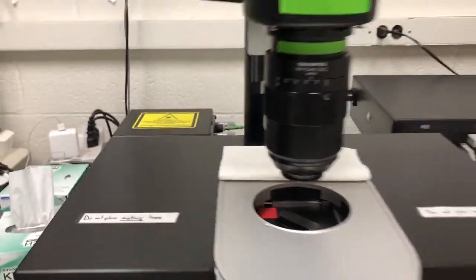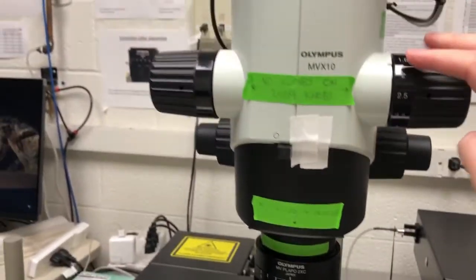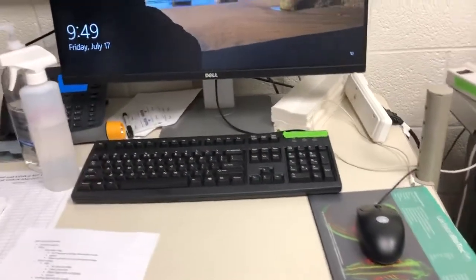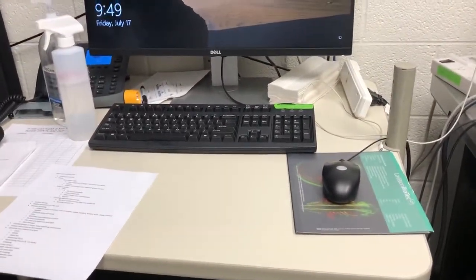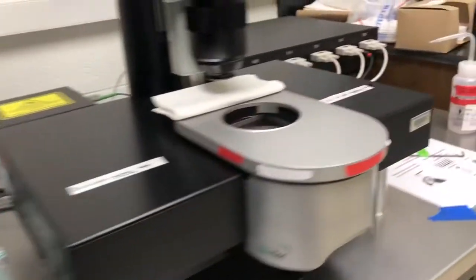Every other thing here — this wrench which we'll need later, these knobs, the joystick, this part of the objective, as well as everything on the computer — you should not be wearing gloves. If you do, you will contaminate it, and we definitely don't want that. So please observe that glove rule.